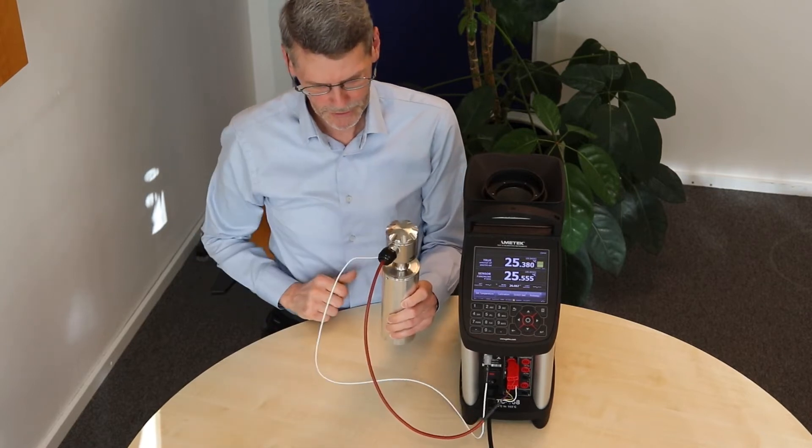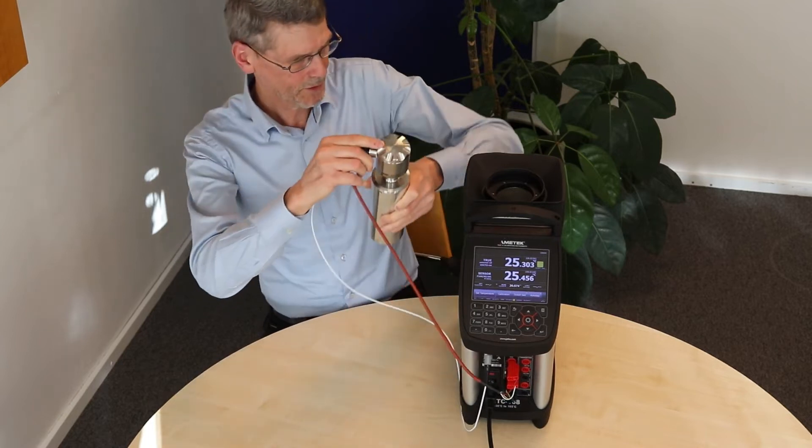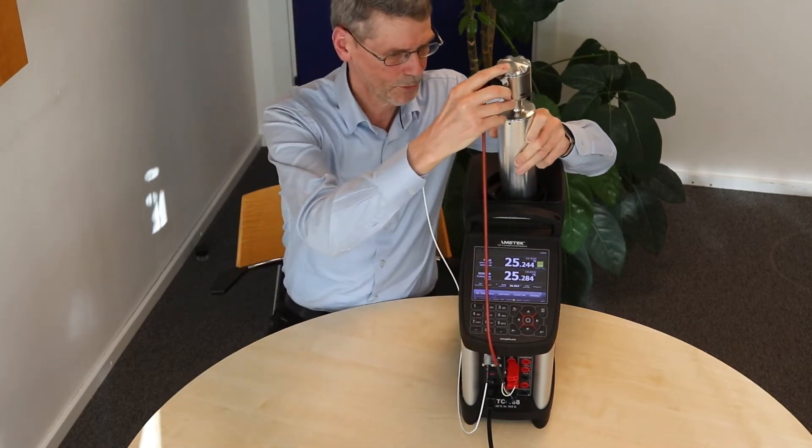Then we mount the sensor under test. The system is ready and we can now put it into the calibrator.